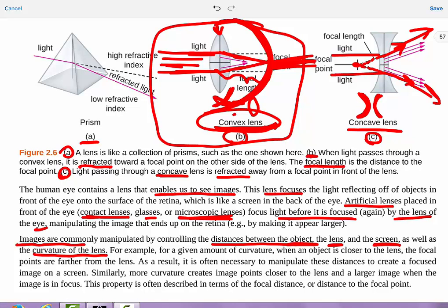Changing the lens, so switching from a lower powered lens to a higher powered lens, is actually a different distance. And then the screen, we don't change that as much in the microscope because our eyes are where they are, although you can kind of scoot closer in or further away depending on how you want it to be focused.